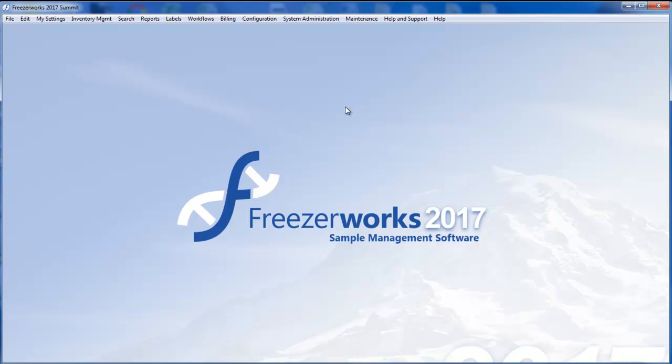Once workflows have been configured and assigned to your group, they will be available to process. Depending on the type of workflow you want to process, the steps to doing so may differ. For example, a process shipment workflow can only be run from within a shipping file form. In this video, we will be processing the workflow we configured in part 2 from the inventory list view. But you can run checkout workflows from within samples and explore freezers as well.